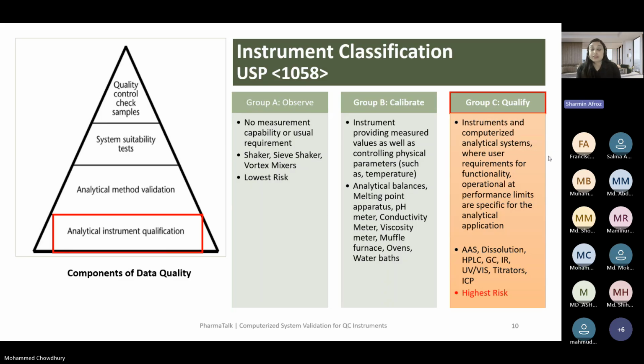The design specification means designing the roles and privileges, like the analyst will get this privilege and the supervisor will get that privilege. You have to sit with QA and agree that the analyst will not get approval or administration privilege. So you have to approve it before the IQ, OQ and other things. Exactly. Before installation of the software, you have to approve your FS, DS, CS.